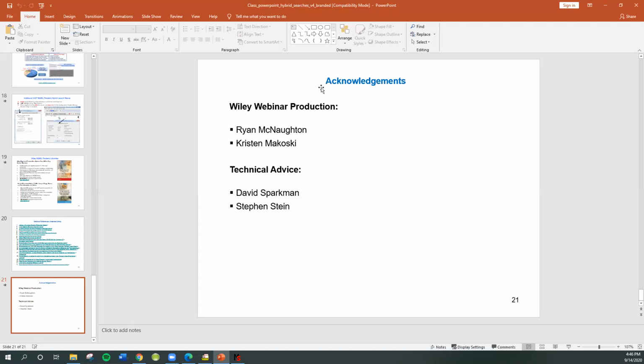Okay, I'm going to make this our last question. Does the NIST search do a good job of guessing the molecular weight? It actually does a pretty good job. Between those software tips that I showed you about the programs you can go after the search and the simple algorithm, but it's not perfect, because I know Steve and his team are working on better ways. If it was perfect, they wouldn't be working on it.